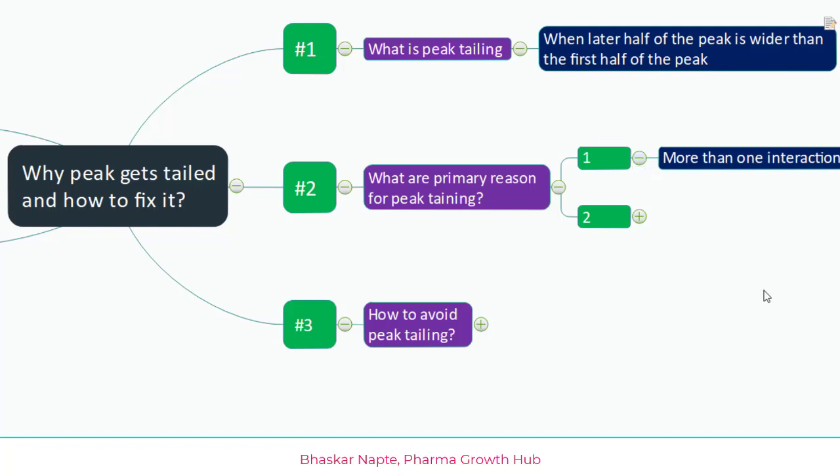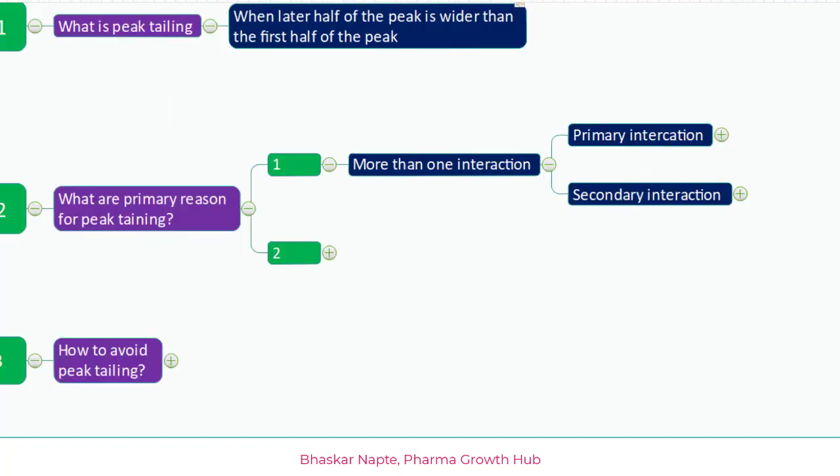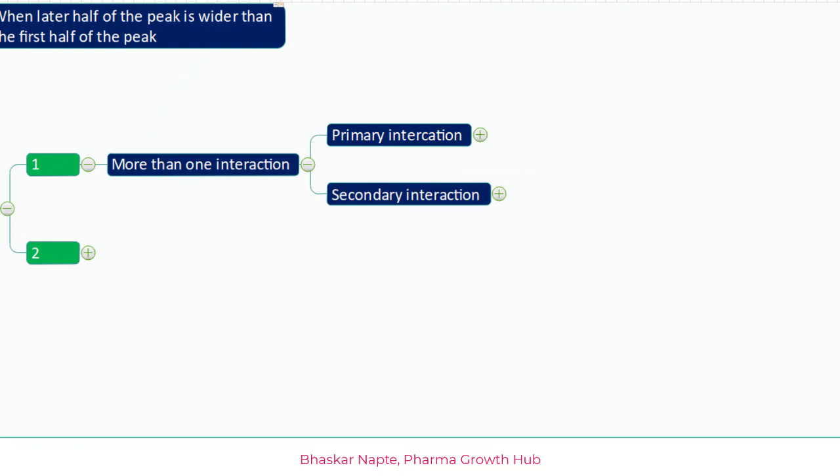More than one interaction can certainly lead to peak tailing. We know that retention of the analyte happens because of certain interactions with the stationary phase. In reversed-phase chromatography, the hydrophobic interaction is the primary interaction by which retention occurs. But is that the only reason, or is there another reason by which your compound also gets retained onto the stationary phase? That is called the secondary interaction.